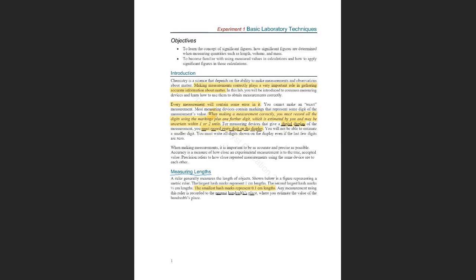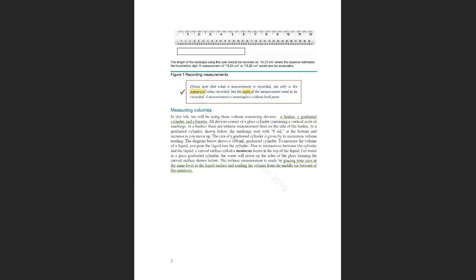When you are measuring length, we know it's common sense, even though you don't need to be in a lab, that you can use a ruler, for example, to measure length. And here it says that the smallest marks represent in our example 0.1. Let me show you. You are going to use this ruler to measure the length of this block.